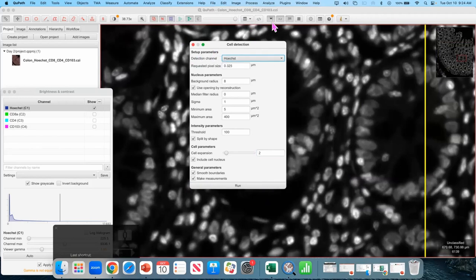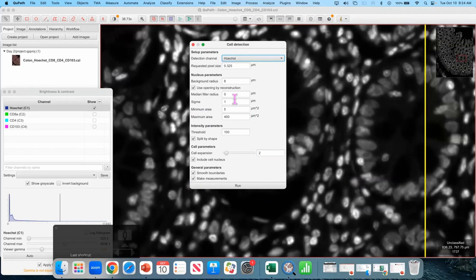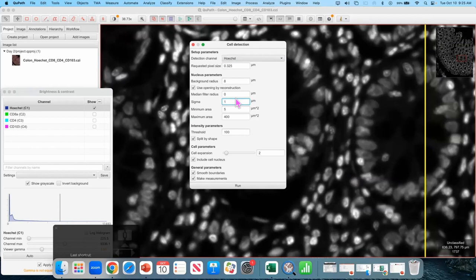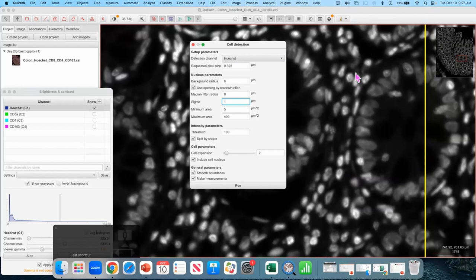What prompted you to change the sigma and those parameters in this image? Yeah, so the sigma is the smoothing parameter. Higher sigmas will get you cells that tend to be a little clumped and lower sigmas will break up cells into like over segmentation. I just, I usually start at one. That's just kind of my standard. It depends a little on your cells.